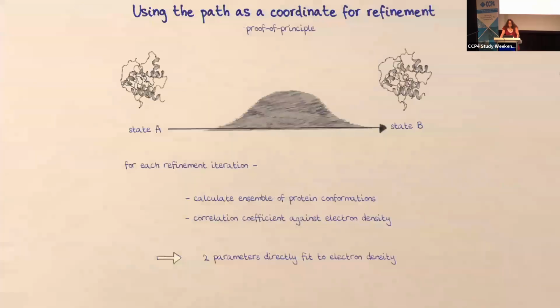So I don't expect anyone to use that in its current form, but this idea of creating coordinate axes where we can move a loop or switch a little bit on the backbone means that that'll open opportunities for making ensemble refinements which are totally deterministic and easy to analyze.